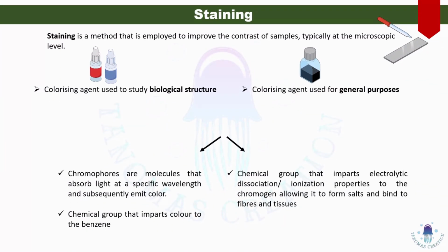Today we'll learn staining procedures. Staining is a method that is employed to improve the contrast of samples, typically at the microscopic level. There are two words that are used interchangeably. One is stain and the other one is dye.